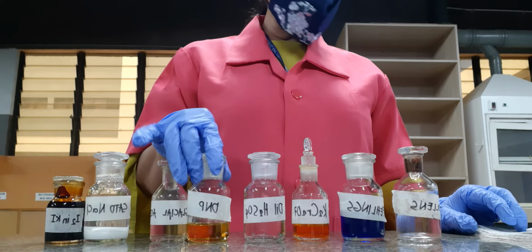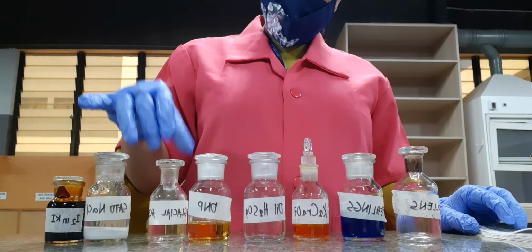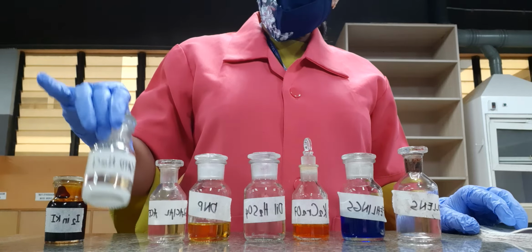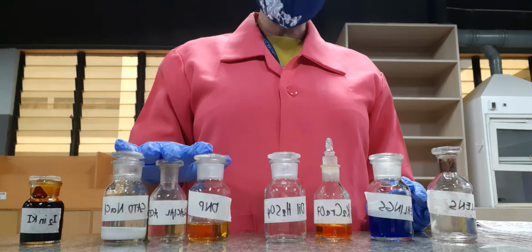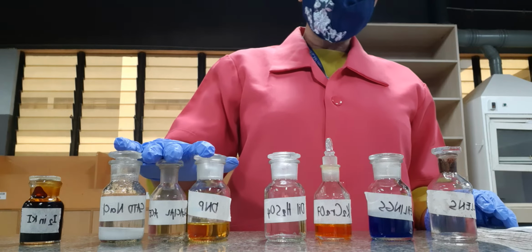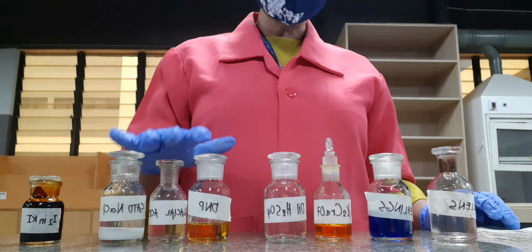and take note of the color. This is yellow in color, and then with the addition of glacial acetic acid and of course saturated sodium chloride. So these are our reagents, one, two, three, four, and five.